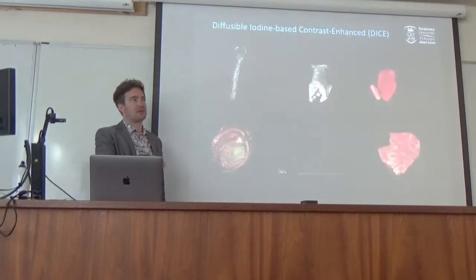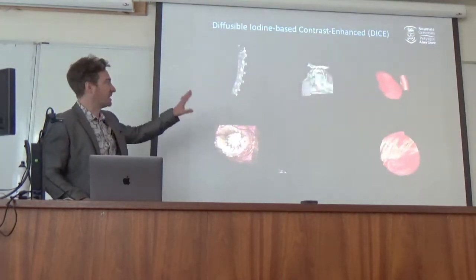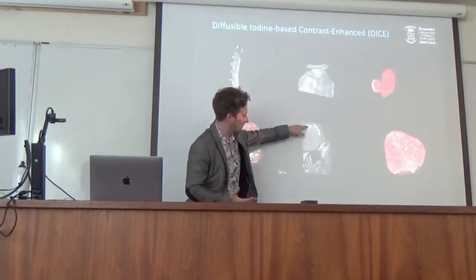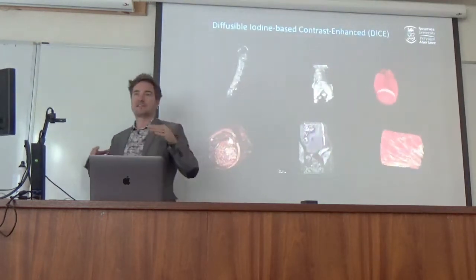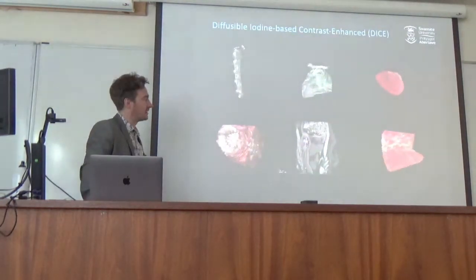The sand dollar was easy, it's just calcium carbonate and air. So segmentation problem, it's really simple thresholding. Something like this, where you have lots of different biological architectures, all of these different intricate shapes, you don't really care much about this, or if we did, that would be great, because it's a different grayscale. But all these different muscles in different directions, we want to be able to segment them separately, but they all show up as the same color. So we're looking for interfaces and things like that.